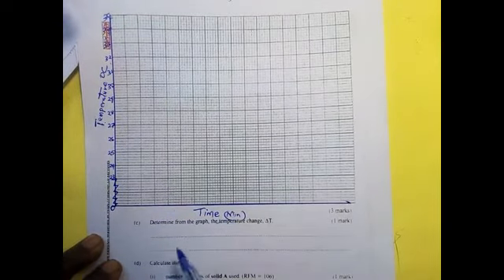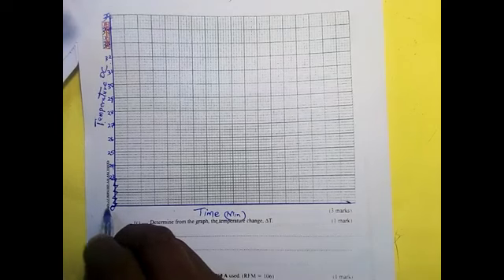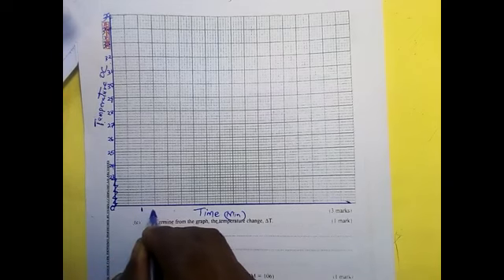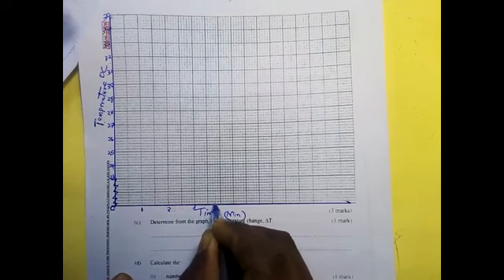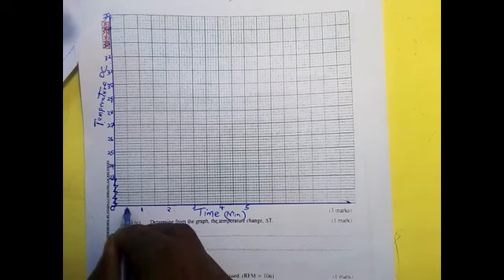Now let us go for time. Our time, we have a range of half a minute. So from 0 we can have 1 minute at this point, and then 1.5, 2 minutes, 3 minutes, 4, and 5. In between here, 0 and this is a half.